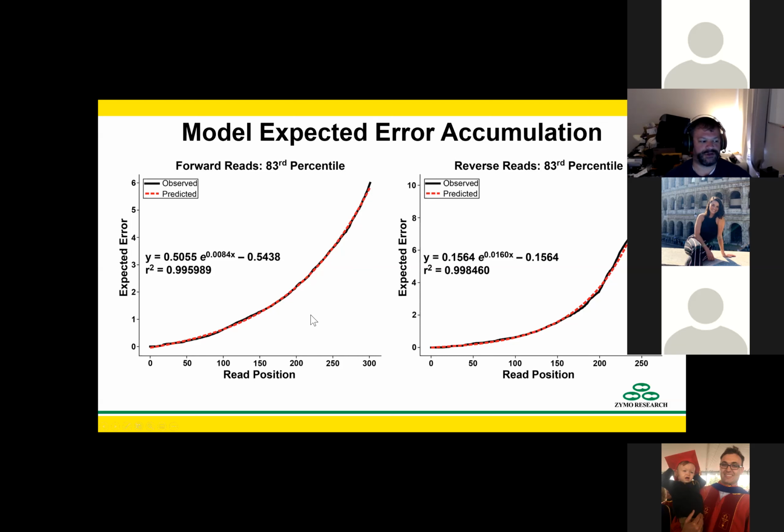Because it turns out the DADA2 pipeline itself is great. This is a pre-pipeline step, but it turns out this is the one that wasn't completely established, and this is the one where I was helping a ton of people who were having trouble.